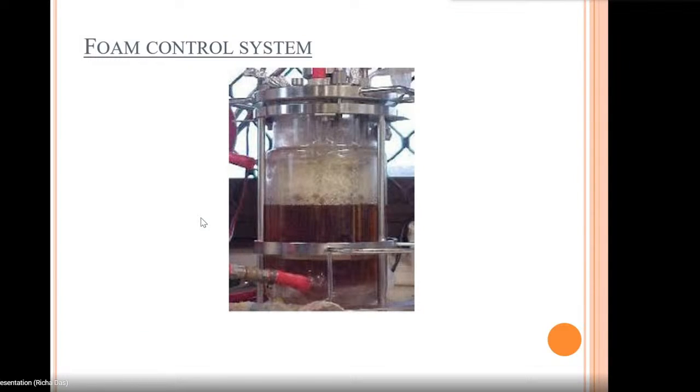So that is why we have to minimize the foam, because if the foam keeps on building, the air exits will be blocked, air will not be able to move outside, and pressure will start building up. So it's very important to minimize the foam.